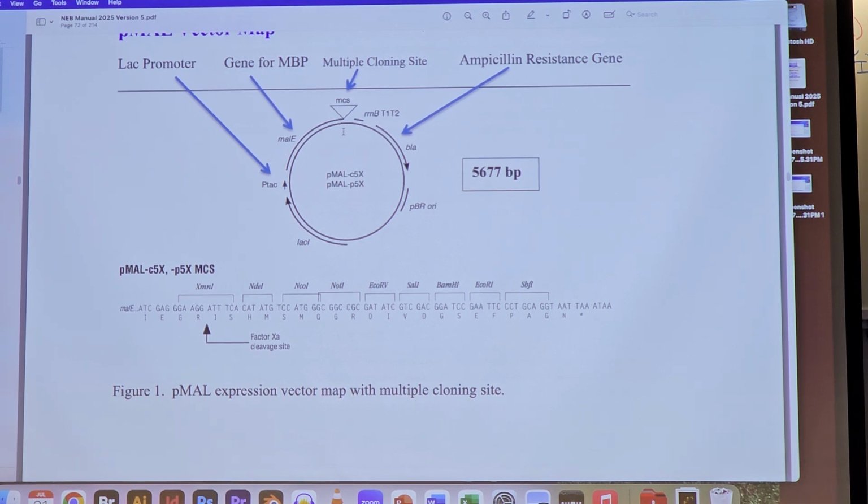Yes? So is this how a usual plasmid would look that we want to use in E. coli for expression? This is reasonably typical. Well, no, I'm going to show you some systems, but this is the one I like to use. I like to use it because the MalE protects this other protein down here, since degradation of foreign protein is a real problem.